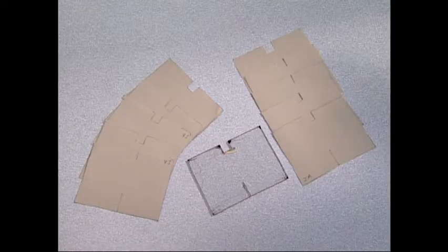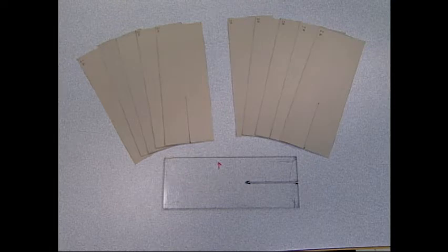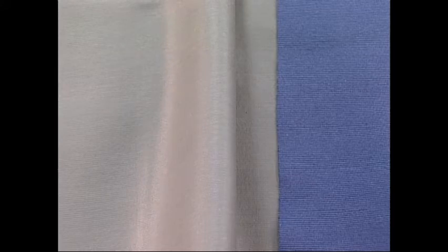There are three basic tests for measuring tearing strength. They are the Elmendorf, the trapezoid, and the tongue tearing methods. The specimens for each test differ significantly from the others. The trapezoid test is used on many types of fabrics and is disclosed in the ASTM Test Method D5587, Test Method for Tearing Strength of Fabrics by the Trapezoid Procedure.